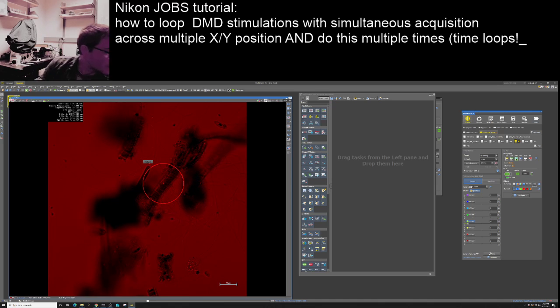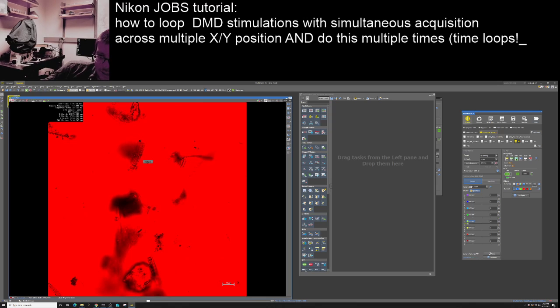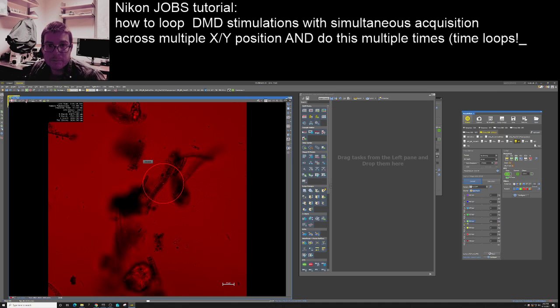Got it. Maybe I'll take the Optivar out, actually, in this case, to get accurate results, because I realized I was not doing that before. So, okay, yes, you can see that we're stimulating, and the fluorescent signal is insane, which is why it's going a little bit out of the circle here.